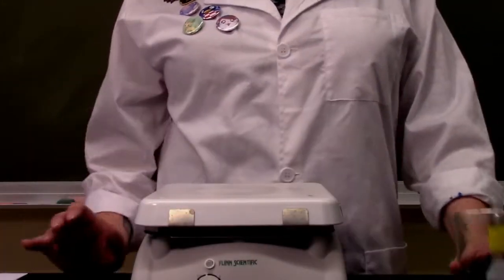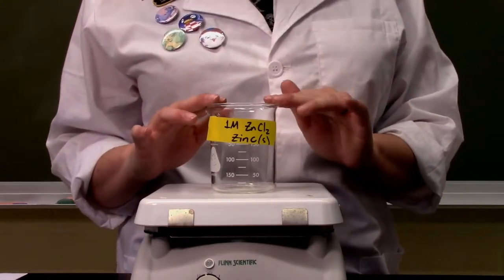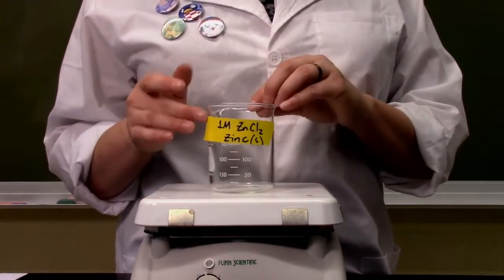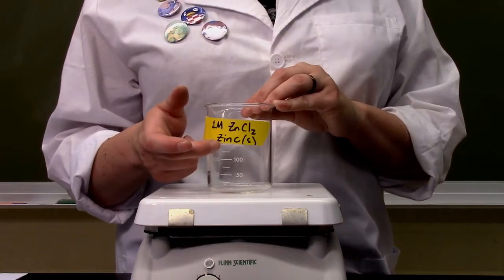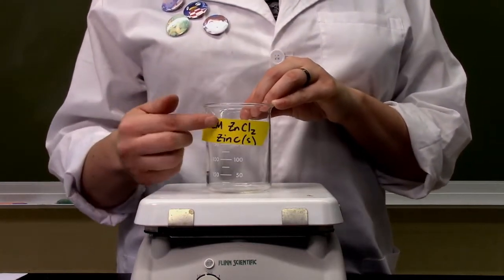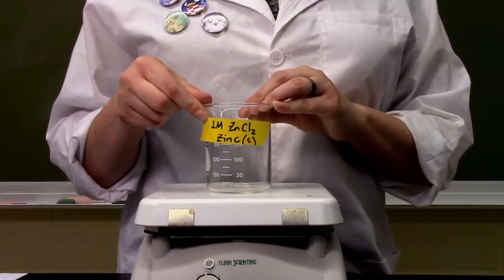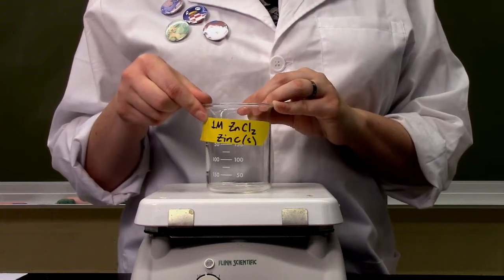In this next part, I will be taking this 250 milliliter beaker, and I will be adding zinc metal, actual solid zinc, to the base, to the bottom. And then I will also be adding some liquid to it. This liquid is a solution of zinc chloride in water.